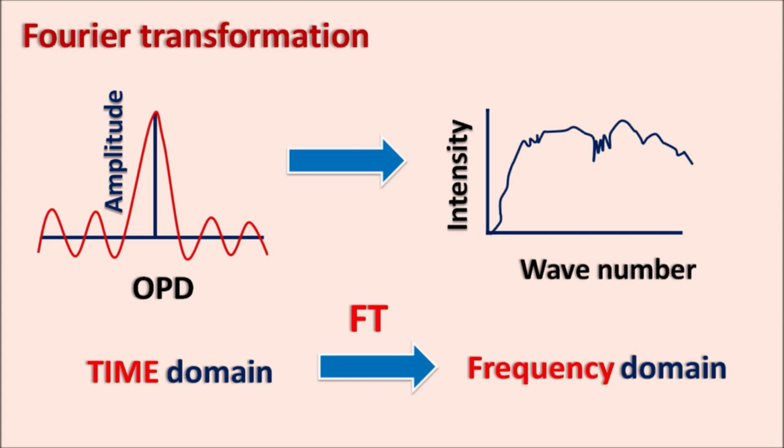In this way, every time a particular wavelength of radiation passes into the sample, by which we can easily observe the IR spectra, where the transmittance can be measured at a particular wave number with high accuracy as well as precision.